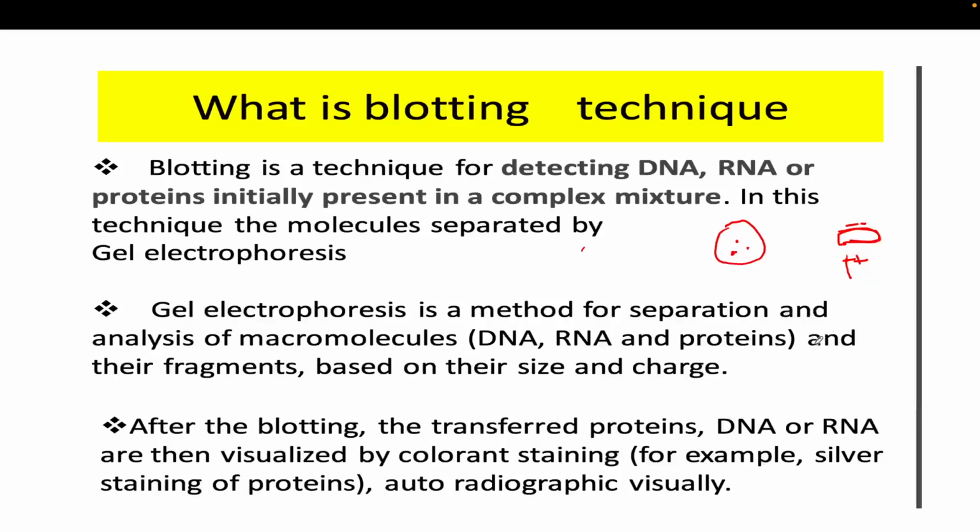Likewise for protein, when we prepare the protein sample for gel electrophoresis, what we generally do is add SDS in the loading dye. Sodium dodecyl sulfate is a kind of anionic detergent. This anionic detergent neutralizes the protein charge and provides a negative charge to the protein.